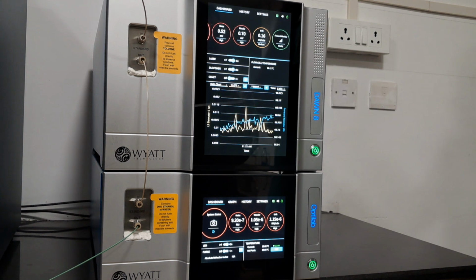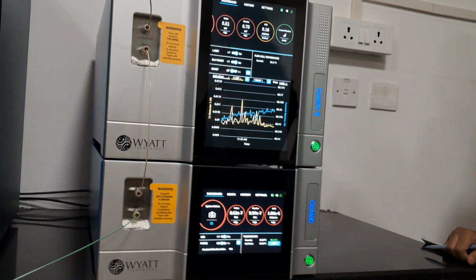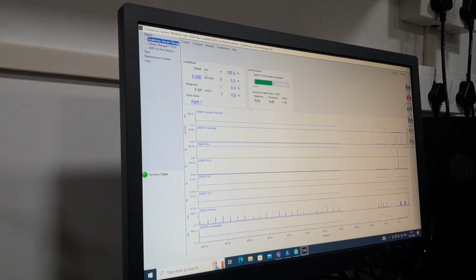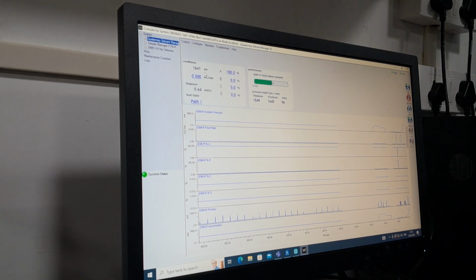Okay, so we will just create the instrument method here. The document-wise details and everything, the do's and don'ts, we can prepare later. I have everything ready-made, so we'll optimize it and I'll give it to you. Inlet and outlet, everything will be there.